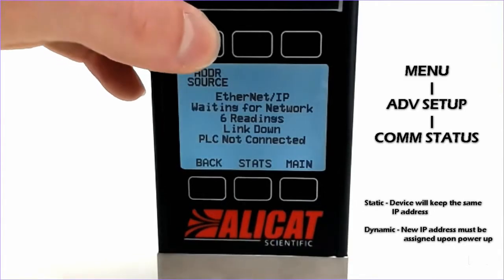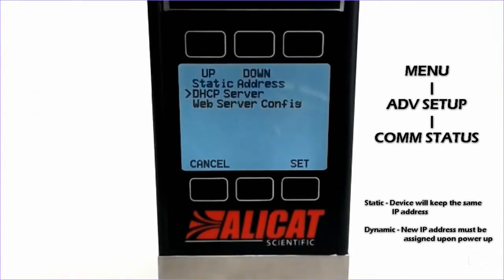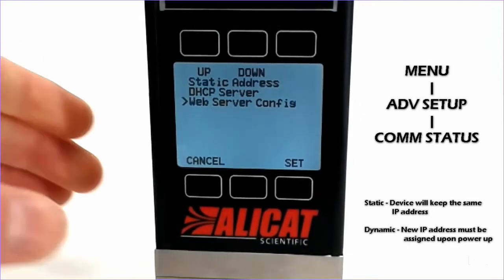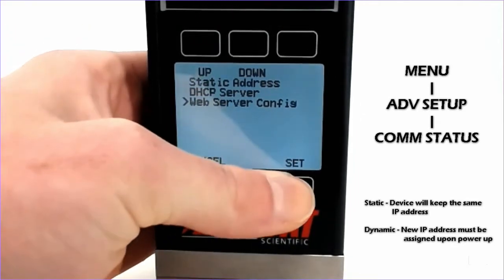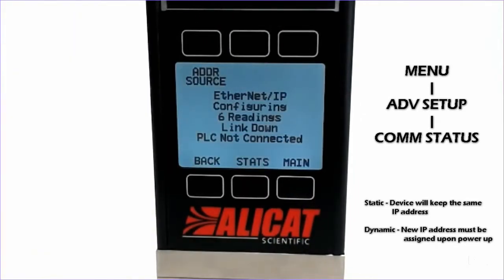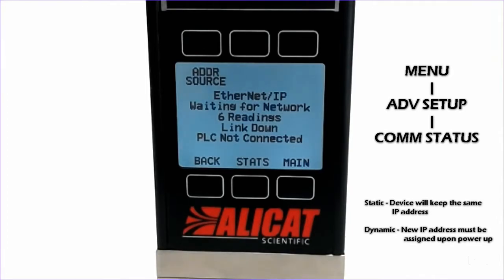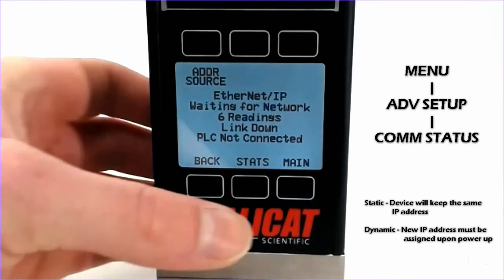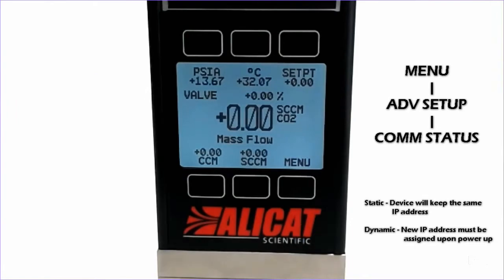Changing the source to our last option, web server configuration, will allow the device to communicate over the Alicat embedded web server to adjust the IP address as well as other configuration settings. This can be done by simply typing in the existing IP address into a web browser. And that is how you adjust your IP address as well as communication settings on an Alicat device.